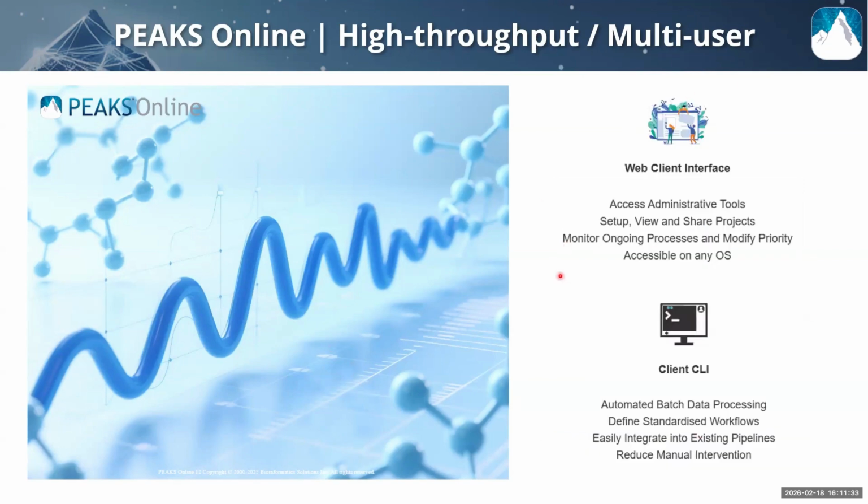So Peaks Online actually offers two different interfaces. We have the web client interface and we have the command line interface, or CLI. And the web client interface provides a graphical user interface designed for interactive workflow configurations and in-depth data exploration. So this essentially happens through a standalone web browser. So you can easily set up your workflows, adjust parameters, or monitor job progress all through a web browser such as Chrome or Edge, which makes it really easy access for you.